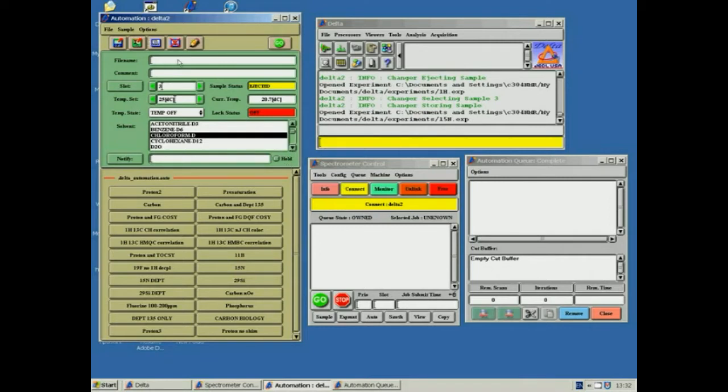If the connection is dropped or the red light on the data acquisition unit is on, please inform Dr. Lewis. The Automation window is where the experiments are submitted. First, enter your directory followed by a forward slash and the experiment file name into the box at the top. This is done by holding your cursor over the box and entering the text. You may then want to enter details of the experiment underneath.